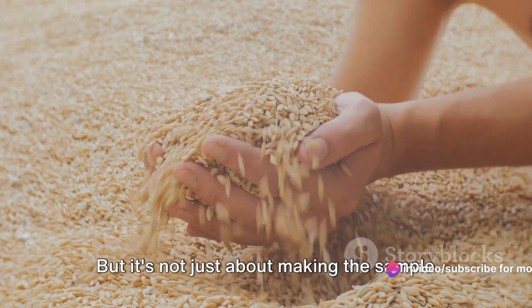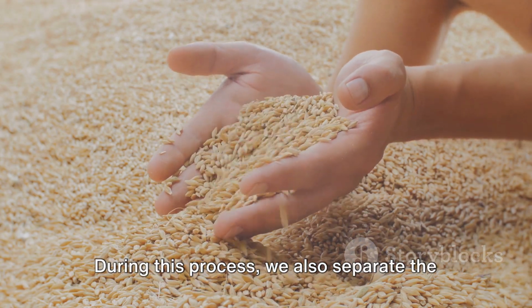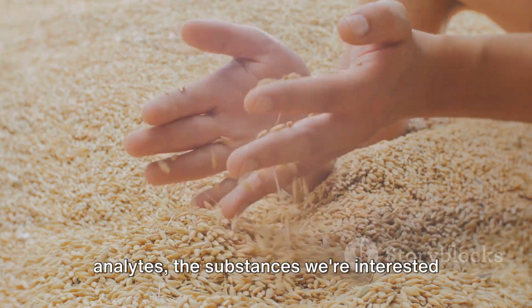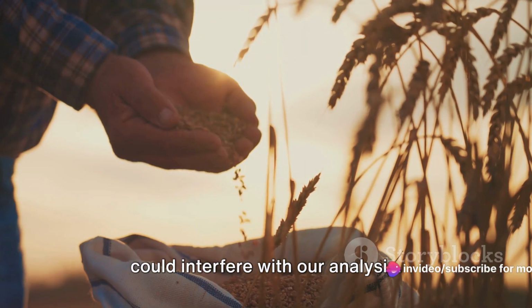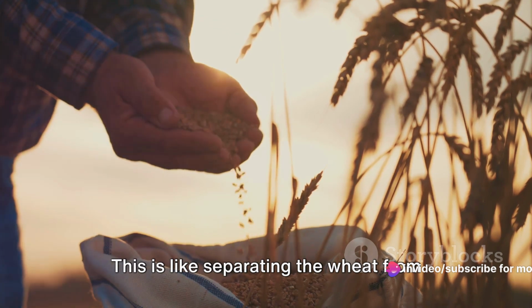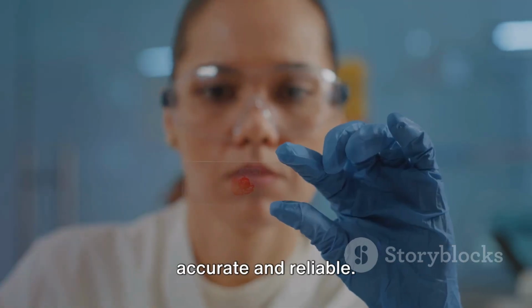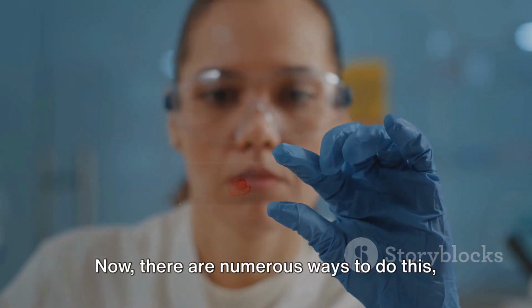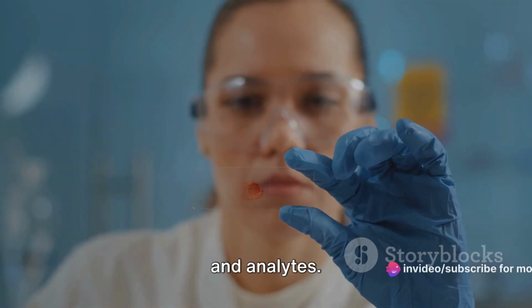But it's not just about making the sample fit for analysis. During this process, we also separate the analytes, the substances we're interested in, from interferents, the substances that could interfere with our analysis. This is like separating the wheat from the chaff, ensuring that our results are accurate and reliable. Now, there are numerous ways to do this, each suited to different types of samples and analytes.